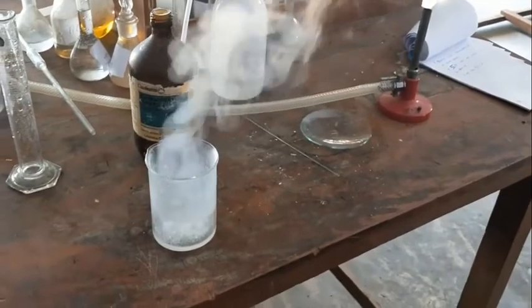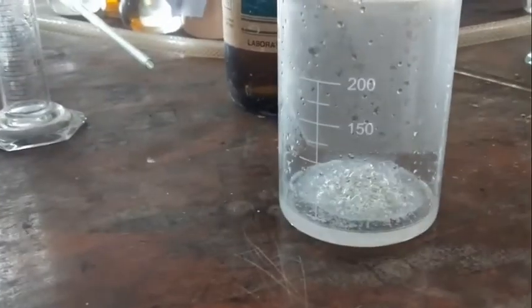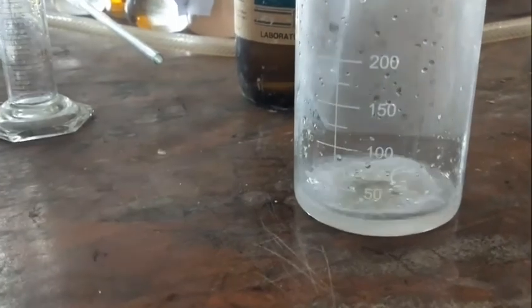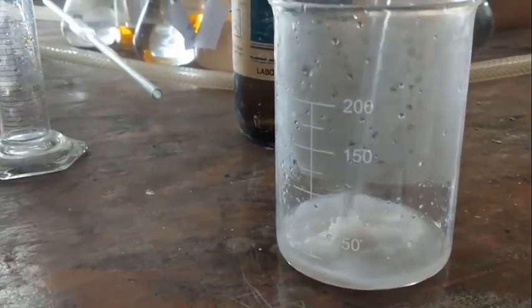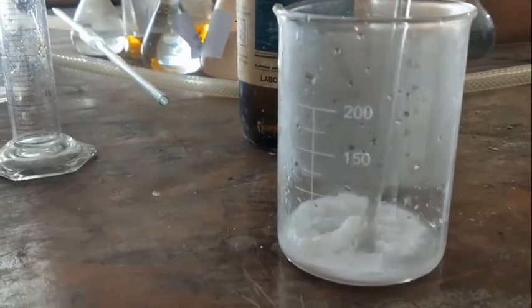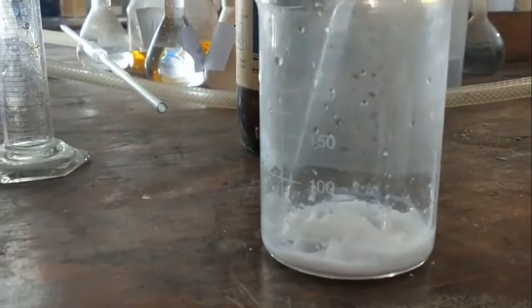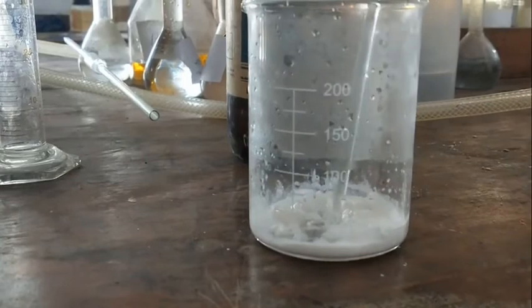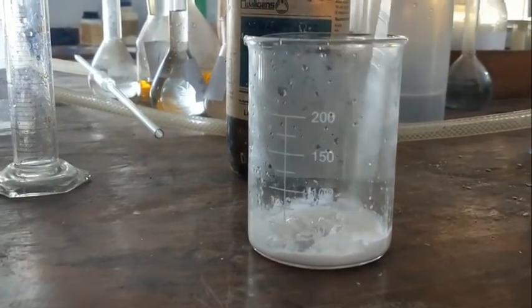So you add sulfuric acid. This white mass is known as urea formaldehyde resin.